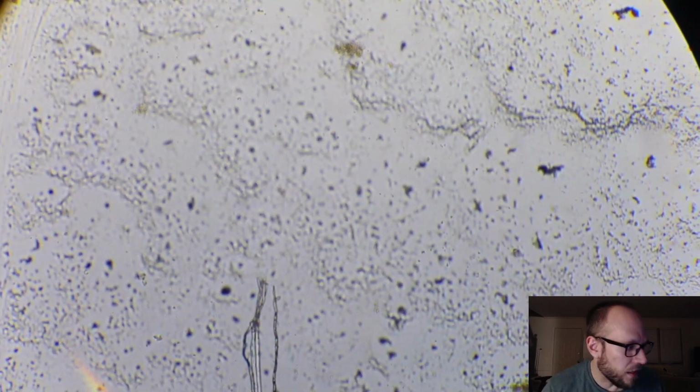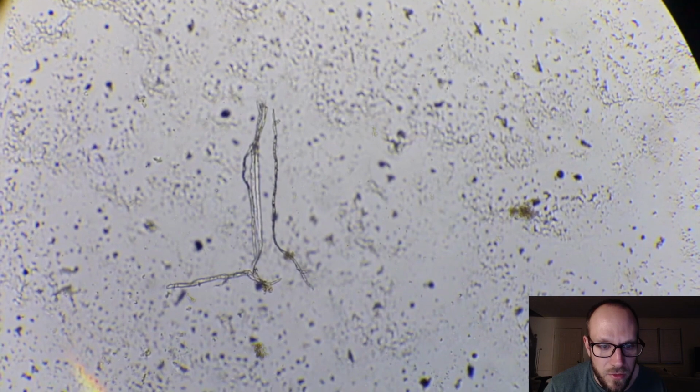You know what? I'm seeing them better in Brightfield. Sad to say, because I love me some Darkfield, but there we go. I think my focus is off, too. Sometimes there's just stuff on the condenser, but that's not the case right now, because if it were, I wouldn't be able to scroll past it like I am. So all this stuff is on the stupid cover slip.